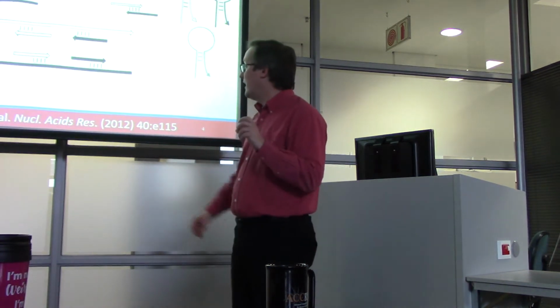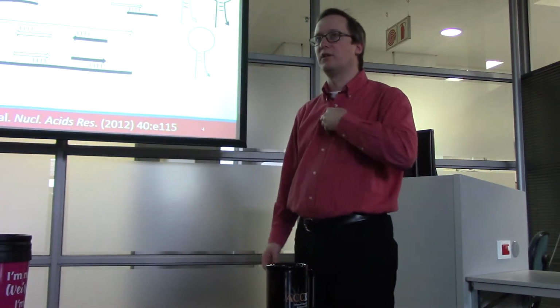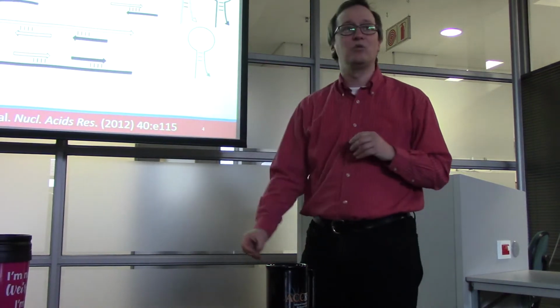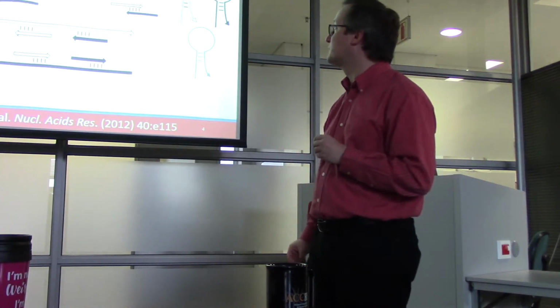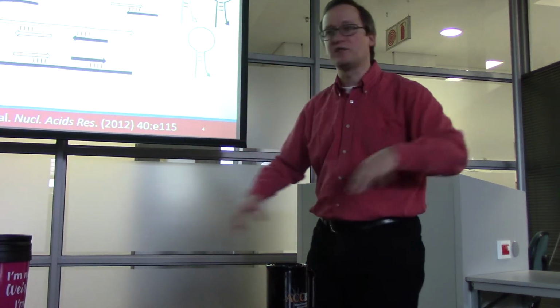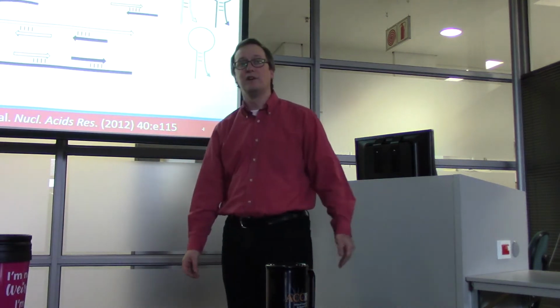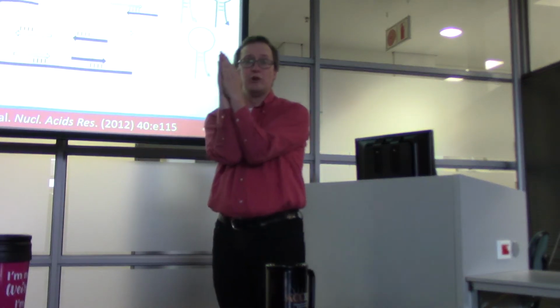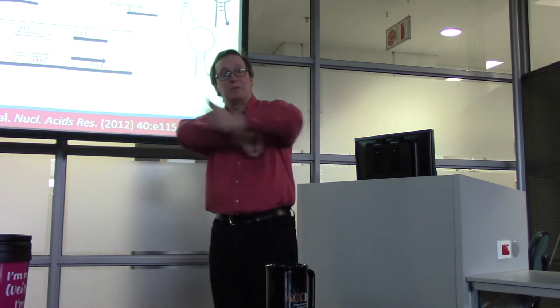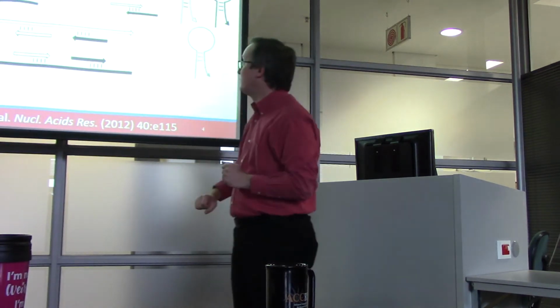All right. Now, I borrowed a figure from this paper here, and we'll talk about the software product that describes it in just a moment. What they've done is to use these black and white arrows to represent primers with different targets. So the black pairing is a different one than the white pairing. We don't want to have homodimers. We don't want a primer that interacts with itself. That's kind of like a worst case scenario. Nor do we want heterodimers, where different primers are interacting with each other in pairs.